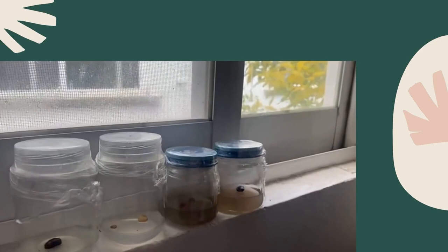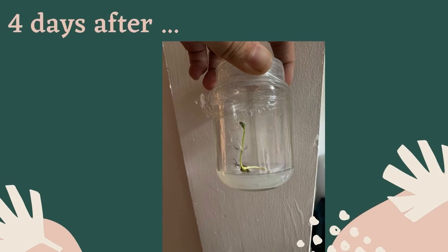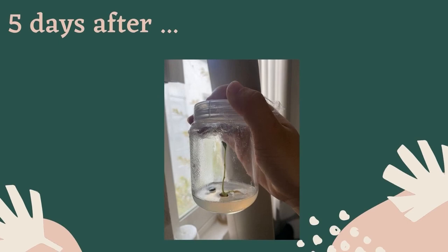After 2 days, the only seed that started to germinate was a lentil seed. Then it started growing up. The medium wasn't contaminated, but the only seed that germinated was a lentil seed cultured in the MS medium, and this was the result.